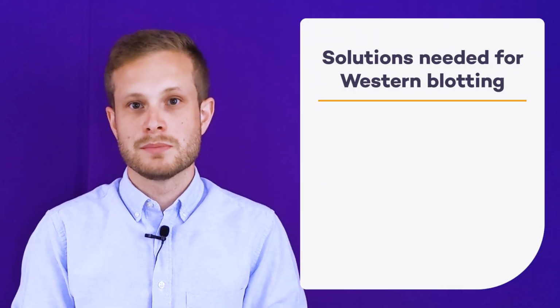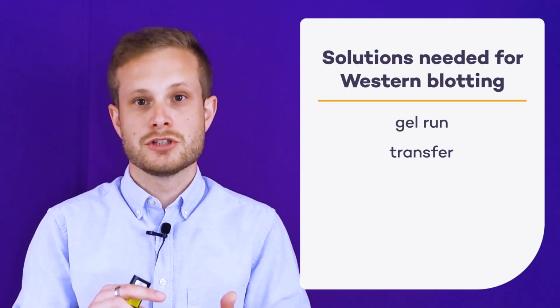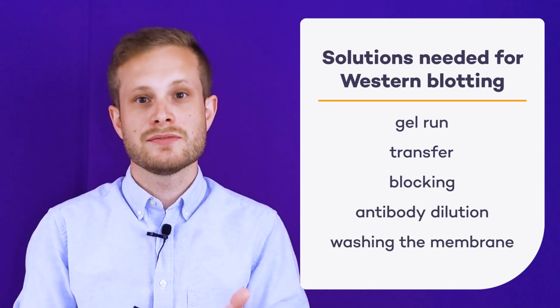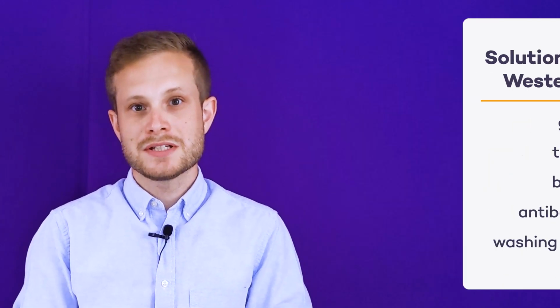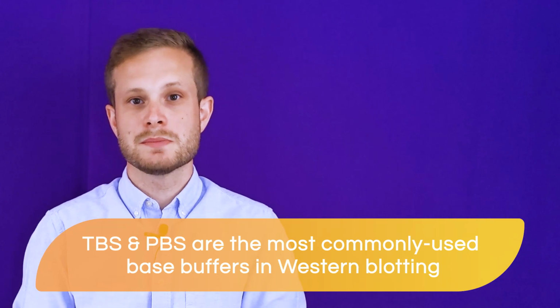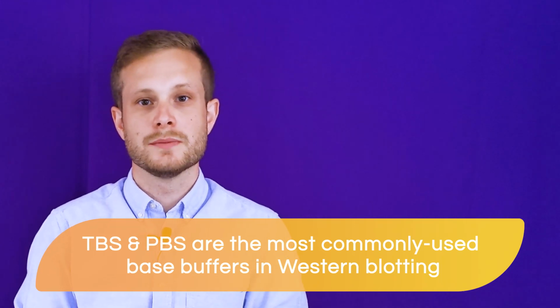Throughout our Western blot protocol, we will need to make and use several different solutions. For example, those used in the gel run, the transfer, the blocking step, the dilution of the antibodies, and for washing the membrane. For each of these solutions, we will typically use a base buffer of either phosphate-buffered saline, known as PBS, or tris-buffered saline, also called TBS. PBS and TBS are the two most commonly used base buffers throughout the whole Western blot workflow, and it's useful to know when you should use each of them.